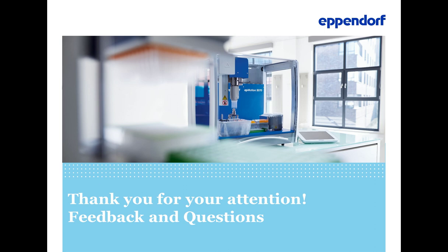That's actually a good question, and I would say that this is something which is highly situational. So there are ways to speed up a PCR. Sometimes you can use fast PCR reagents. So there are fast PCR enzymes and fast PCR other reagents. Another option is if you have a suited PCR, what we have at Eppendorf is so-called fast PCR consumables. These are only strips, and it's a very thin-walled material.